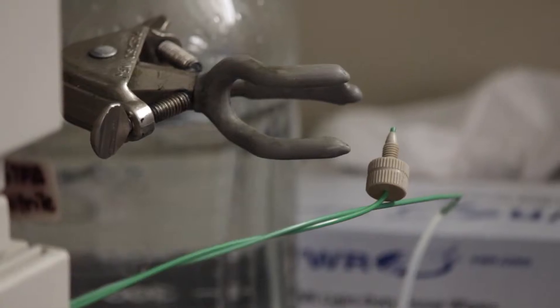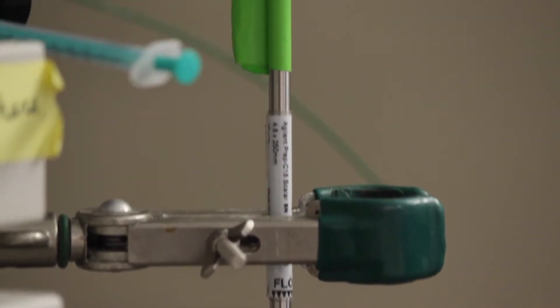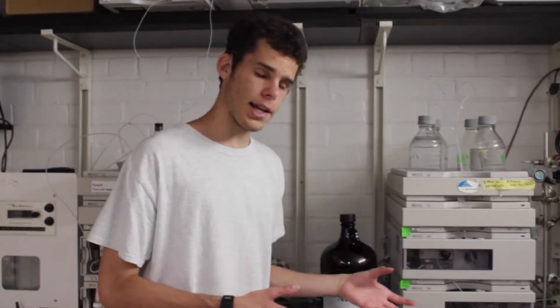If the compound made was really pure, then the computer monitor should only display one peak, giving an indication of how pure that compound is. It's the device that we use for determining the purity of a compound.